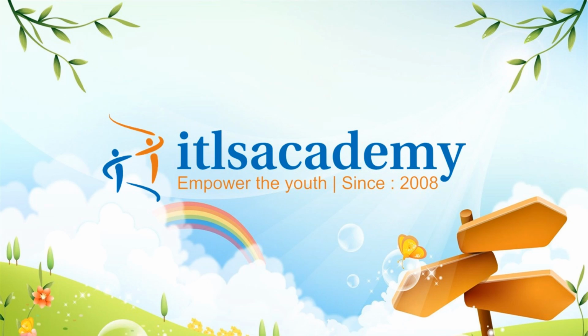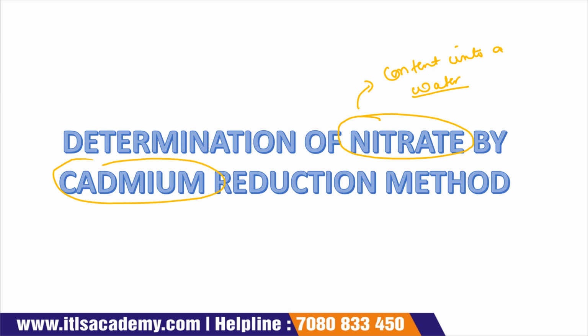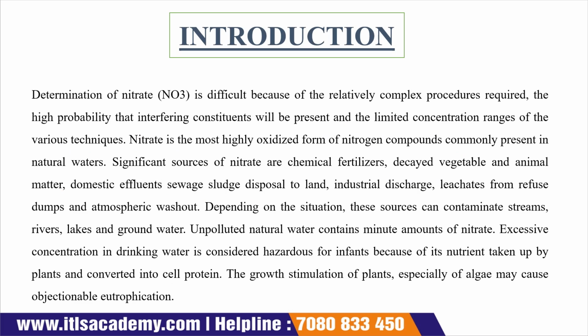Today we are going to discuss the determination of nitrate. The method that we are going to use is the cadmium reduction method. So what we have to do is determine the nitrate content in water, and the method we are going to use is the cadmium reduction method. Before starting the lecture, we have to see the introduction part of it.